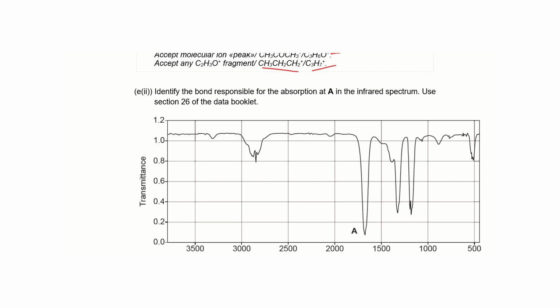And then you have to work out what the 43 is. So in order to do that, the easiest way is to say, okay, I have 58, which is the actual molecular mass of my molecule, and subtract 43 from that. And when I subtract these from each other, I should get around 15. So when I go to the mass spec, 15 tells me that I've actually lost a methyl group. So that peak that I see here is my molecular ion minus the CH3 that belongs to this molecule.